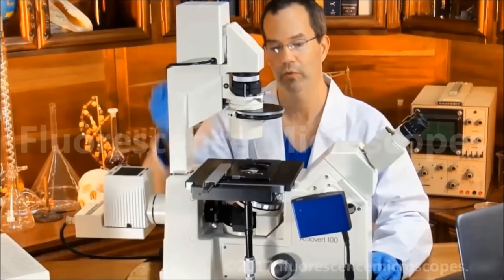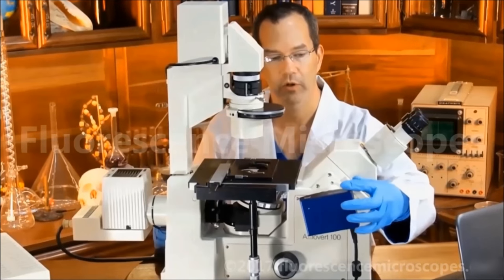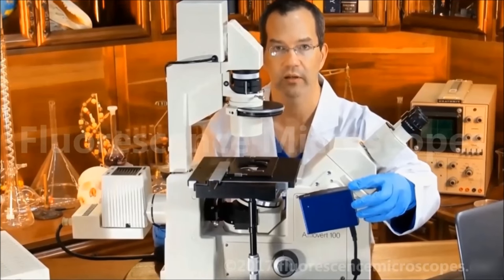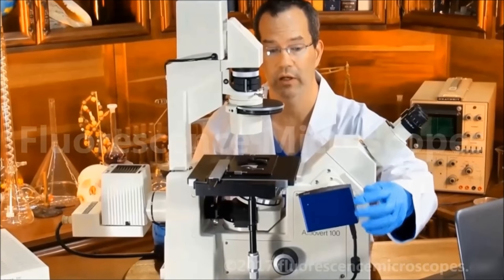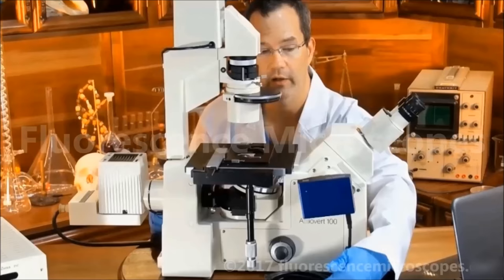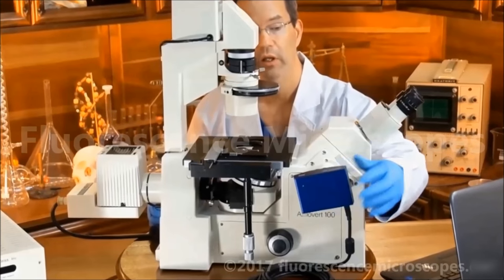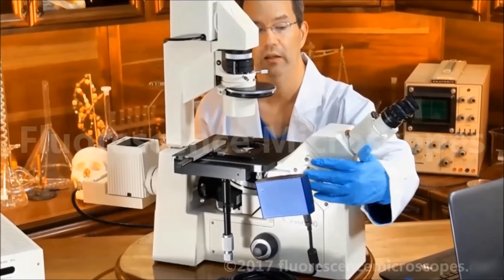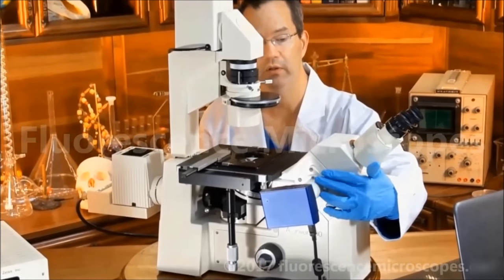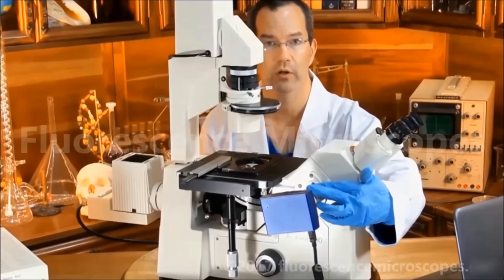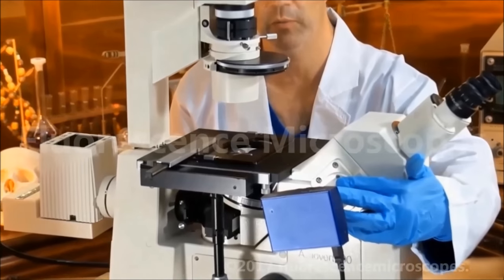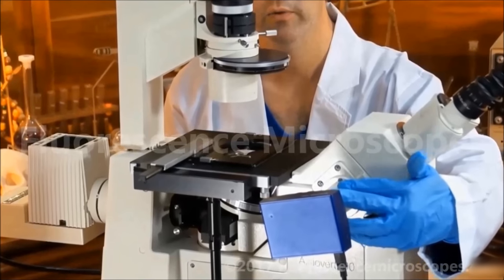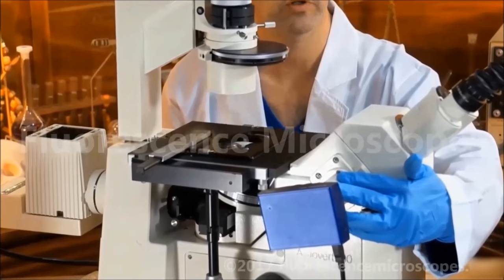This particular unit we're showing with a camera. You'll have to look at the ad to see if it includes a camera or not. This is a firewire cable for the camera. It does have a C-mount attached that goes with the microscope and this microscope has this port. We're showing that this microscope is fully capable of taking photos using this port.